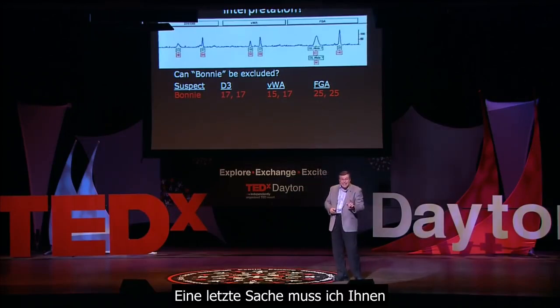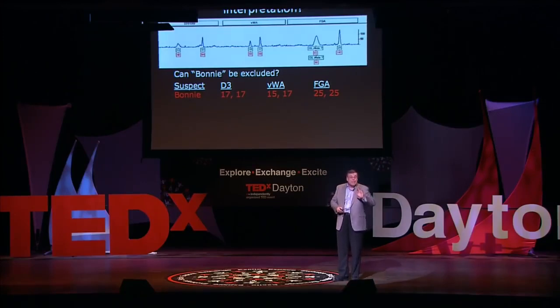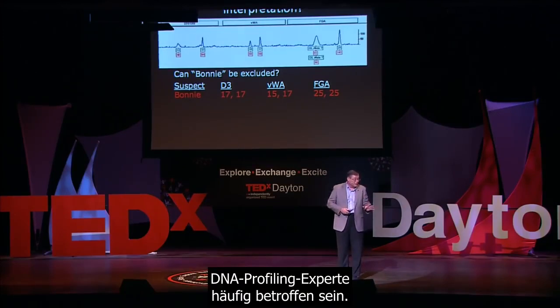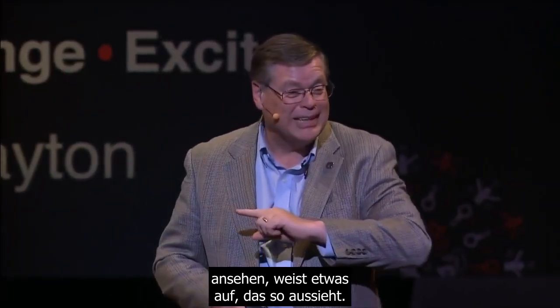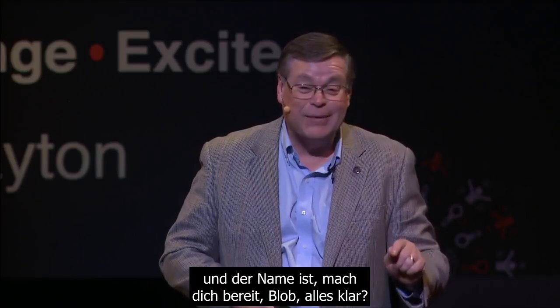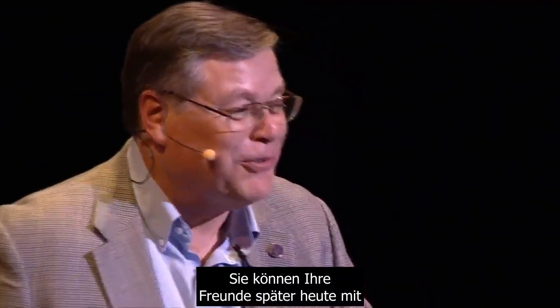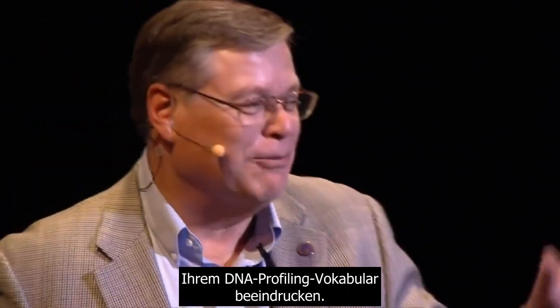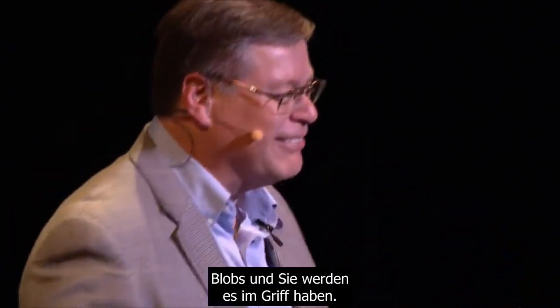There's one last thing I need to tell you as DNA profiling experts. There's some vocabulary. That is something you'll see a lot of in your career as a DNA profiling expert. About every third DNA profile you'll look at will have something that looks like that. It comes up frequently enough that analysts have a name for it. It's a technical artifact, and the name is, get ready, blob. All right? You can impress your friends with your DNA profiling vocabulary later today. Just keep talking about blobs and you'll have it covered.